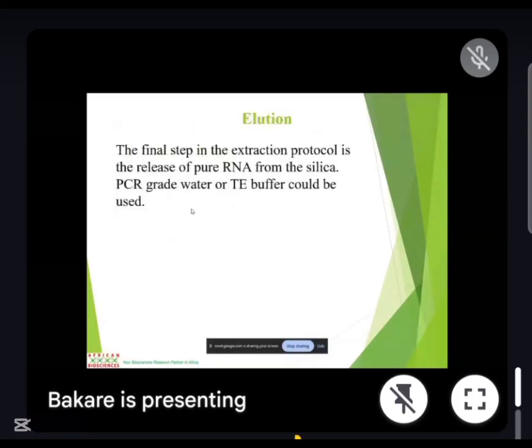So when you are done with your DNA or your RNA, you have to store them immediately. In the lab, we call DNA a thug. There's nothing that you do to DNA that DNA cannot withstand. It can withstand any situation. But you see, RNA is a princess to the core. Even when you are extracting your RNA, you have to extract it on an ice block.